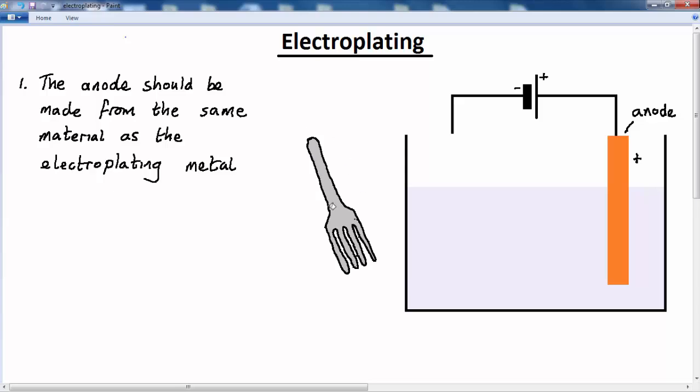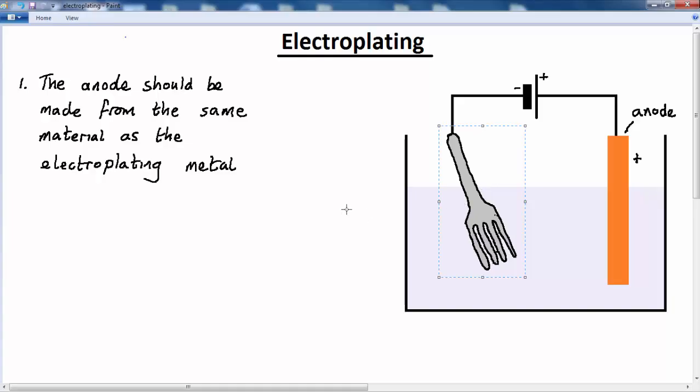Now the object that I'm going to electroplate must become the cathode. So I'm going to attach the fork to the negative terminal of the battery. The fork is going to become the negative electrode, or the cathode.